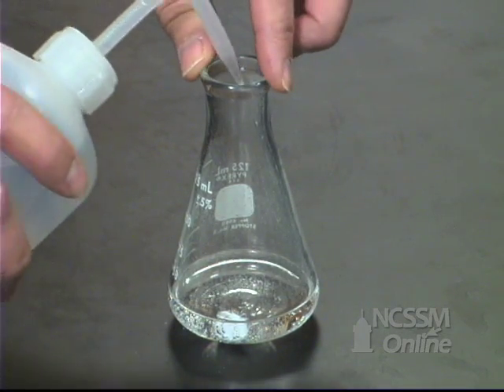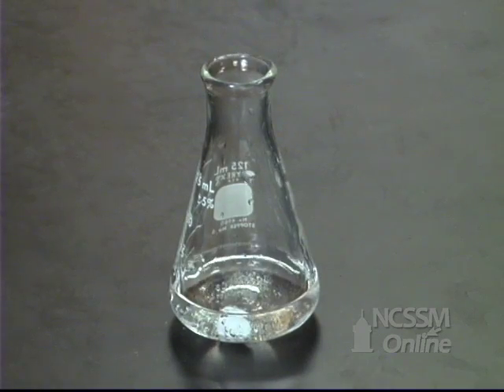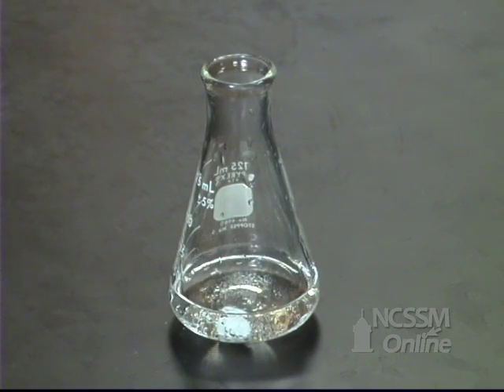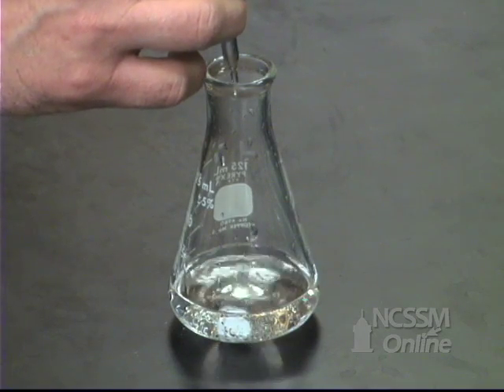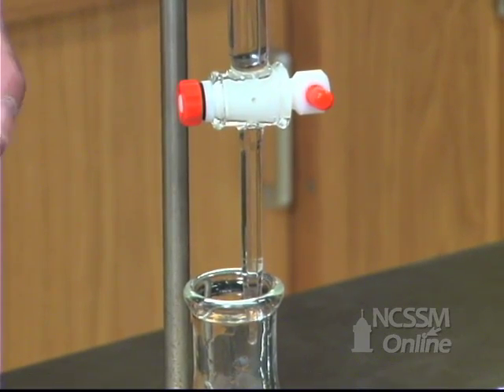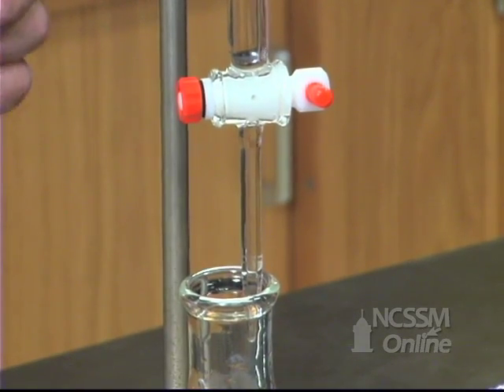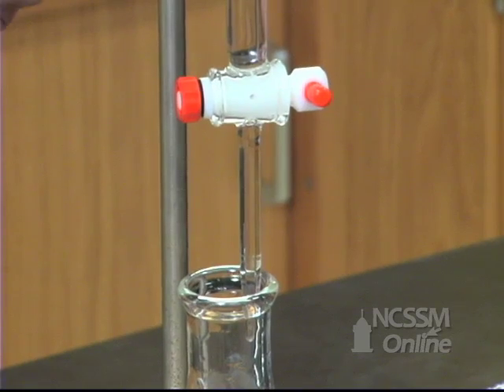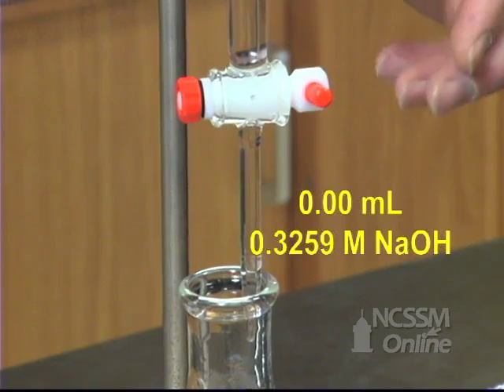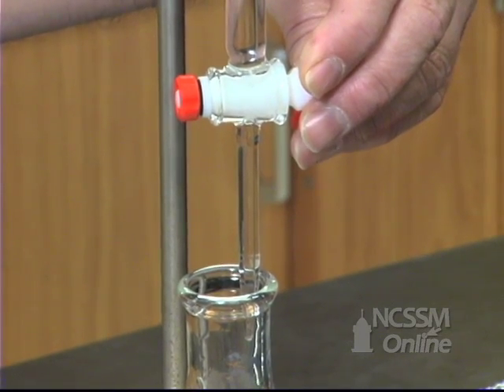We'll now rinse the sides of the flask to make sure that all the sample has had a chance to react. We'll add a few drops of phenolphthalein indicator. Phenolphthalein is an acid-base indicator — it is colorless in acidic solution and pink in basic solution. We're going to titrate the excess HCl. We filled the burette with a standardized solution of sodium hydroxide and have taken an initial burette reading. We're now going to slowly add the sodium hydroxide solution until we reach a pale pink endpoint.